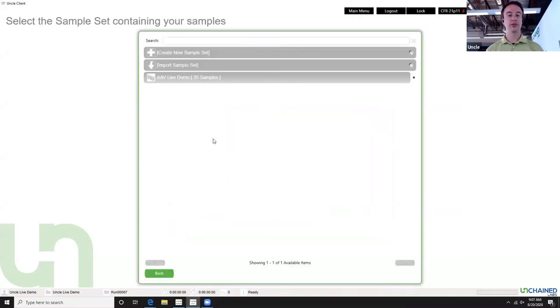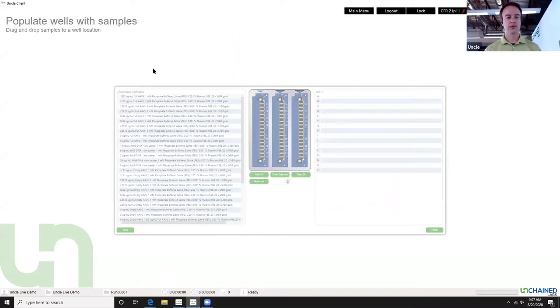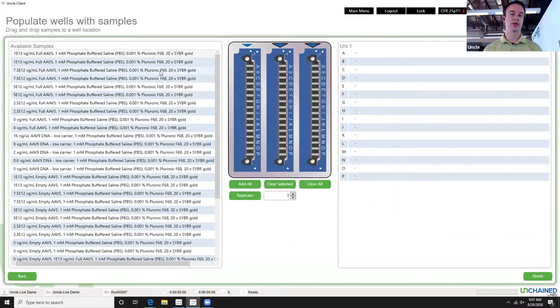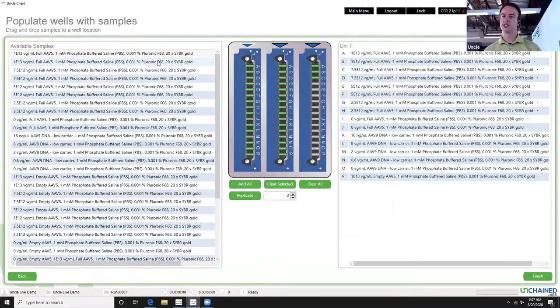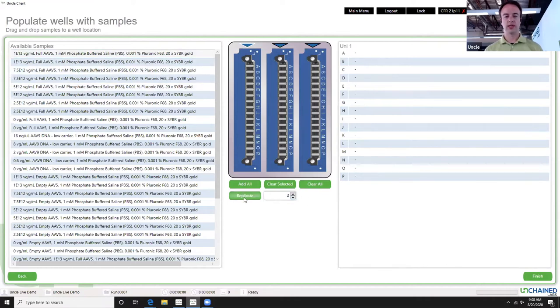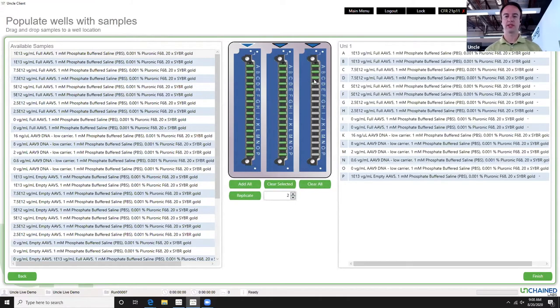In this run, the first thing we do is assign our sample set. I've preloaded an AAV live demo sample set with all the samples that correlate to what we're going to look at in UNCLE analysis. You'll see that we have a dilution series, some DNA controls, empty controls, and then a mixture of samples. I can add all those samples to my Uni — I've set this up in Excel in duplicate, so it's very easy to assign all samples in duplicate. Since I've already put together the sample set in Excel, I can add all samples and they're ready to go.